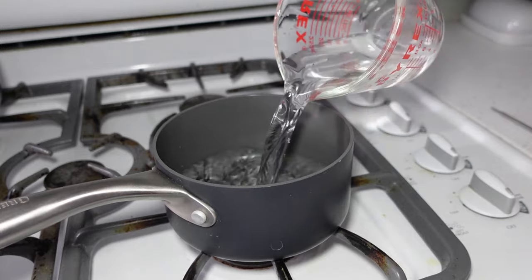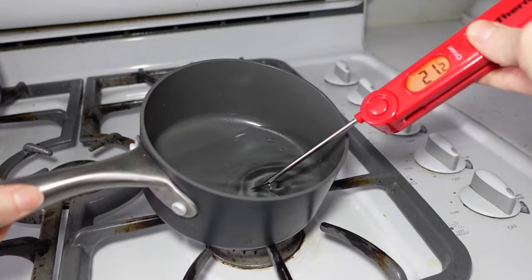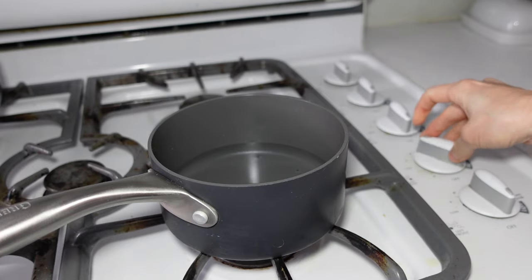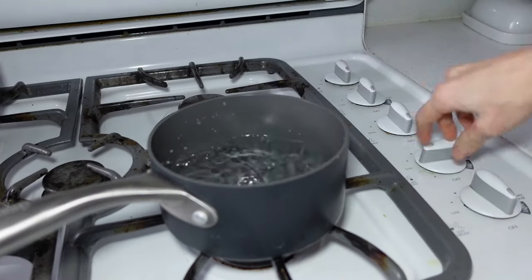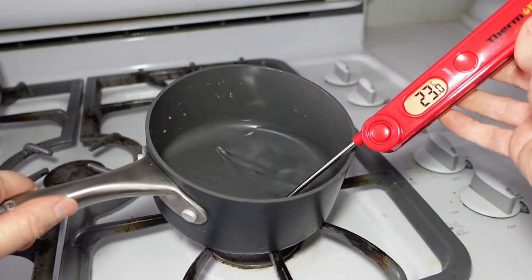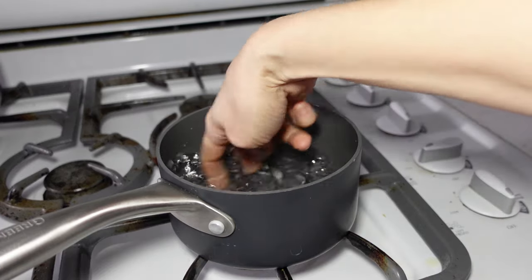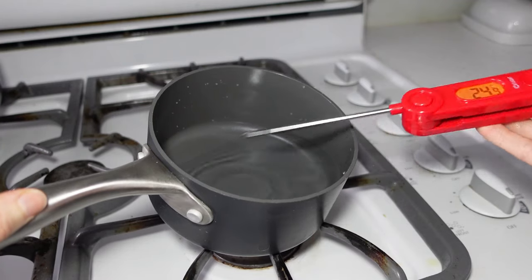Pour the water into a saucepan. As you can see with this example, the temperature is only a couple of degrees off, so warming it without overheating will literally only take seconds. Turn the burner on low and use your hand or a utensil to swirl the water around briskly, then quickly turn the heat off. Recheck the temperature — here it's at 24, so repeat to bring it up one degree. Recheck the temperature and now it's perfect.